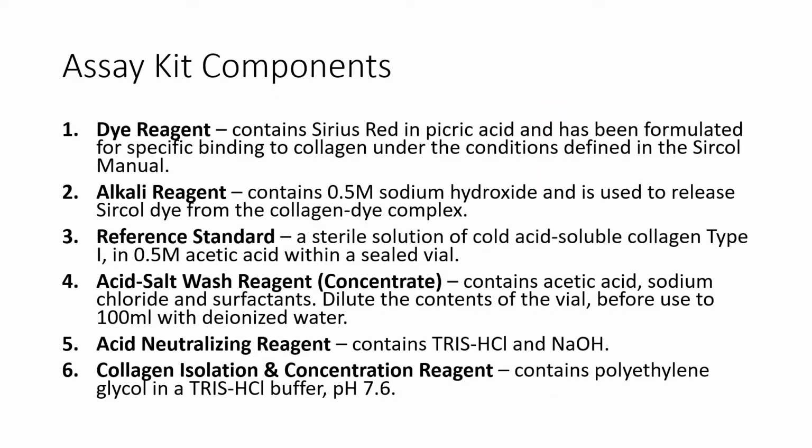So when you open the Sircol soluble collagen assay kit, you'll find several items within the kit, namely a dye reagent, an alkali reagent, a reference standard, an acid salt wash reagent, an acid neutralizing reagent, and last but not least, a collagen isolation and concentration reagent. Two items in particular I want to point out.